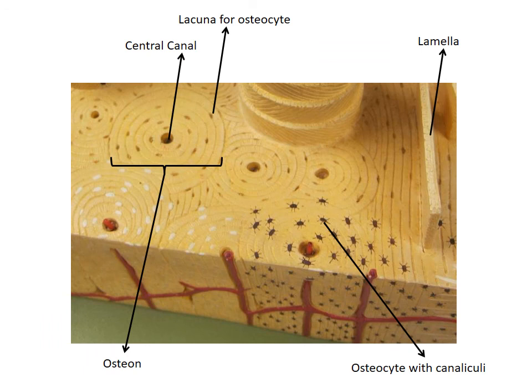From the overview, you can see this little section. This would kind of be the outer part. Now, in real life, the osteons aren't as nice and organized as they look here. But that's the osteon. You see the central or the osteonic canal.